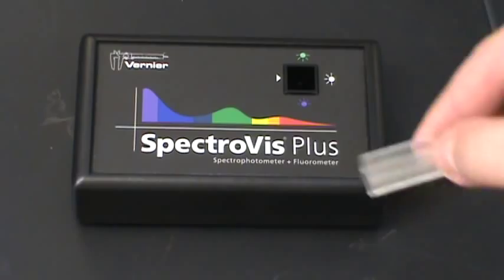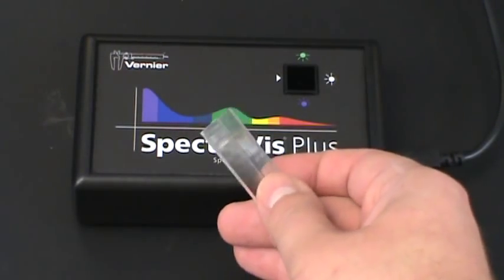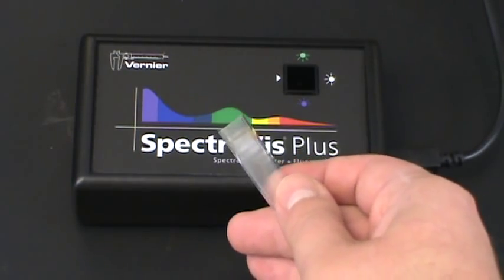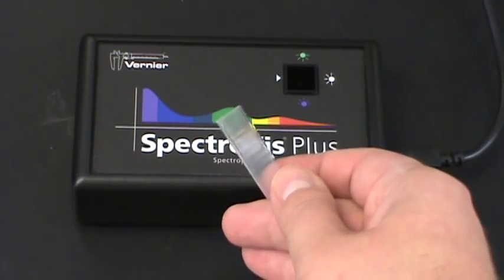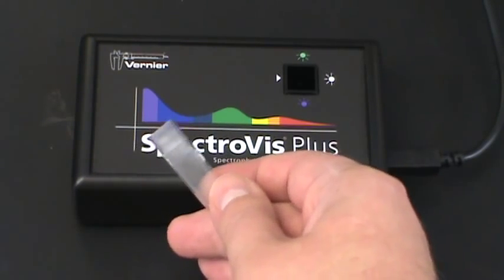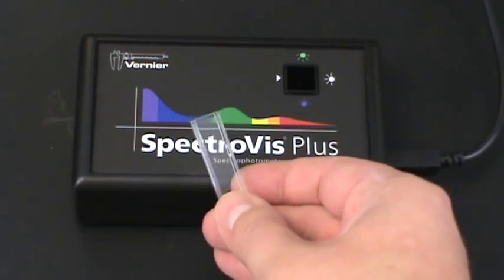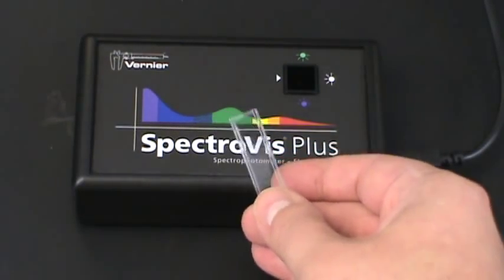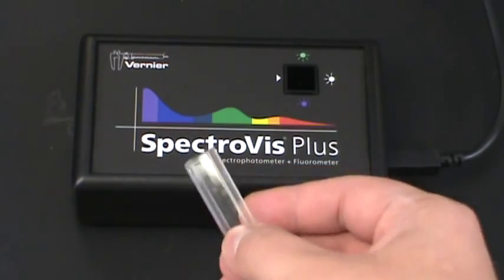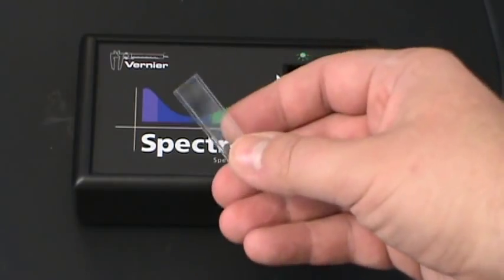Now remember, when we look at our cuvettes, our sample cells, two sides across from each other are patterned, so they're cloudy. Notice you can see that there's a word behind that, but you can't really see it well. The other two sides are clear. We can read right through them. The clear sides are the ones that we need to have light passing through for this experiment.